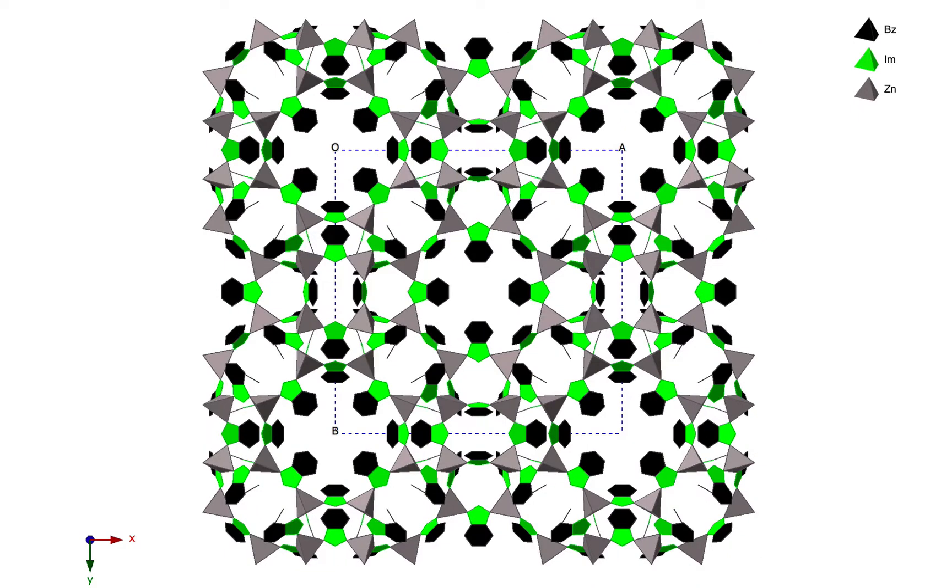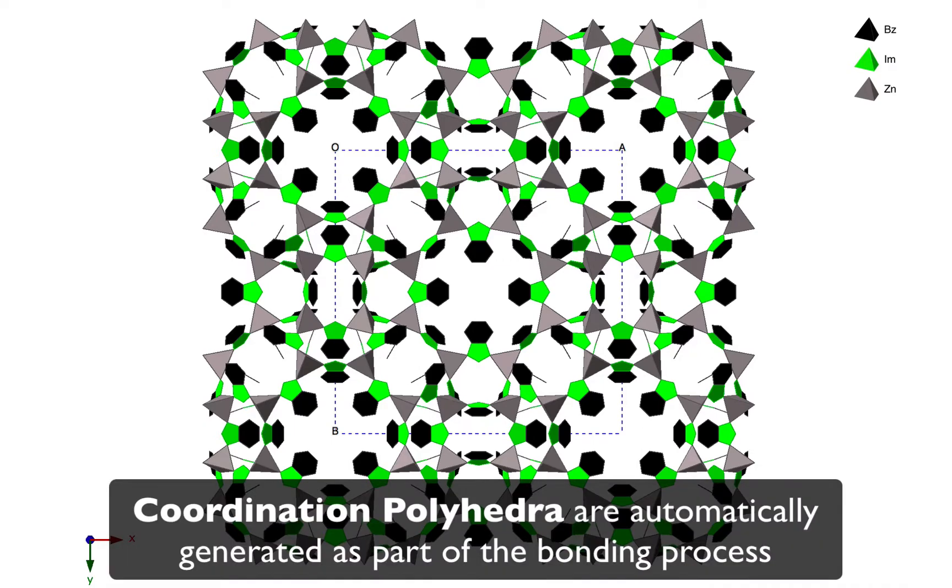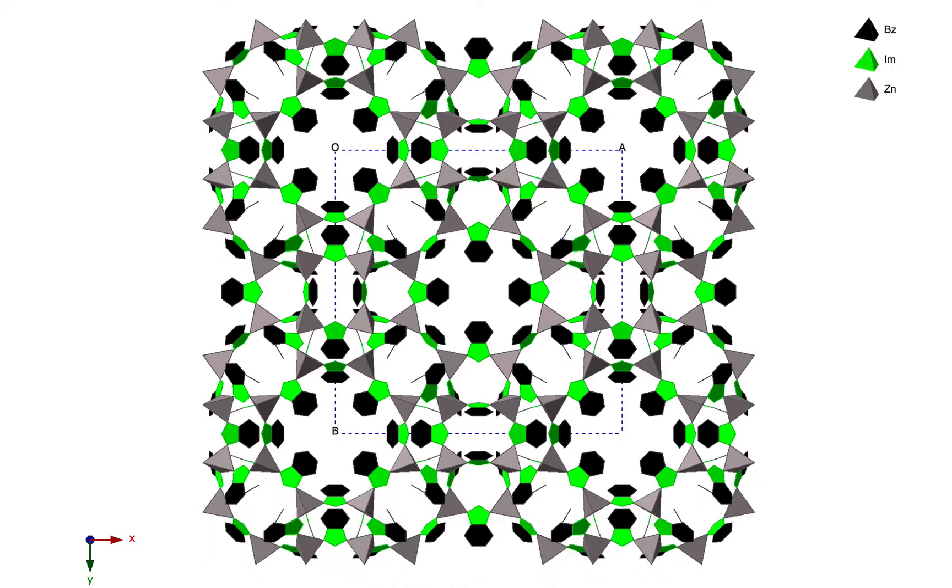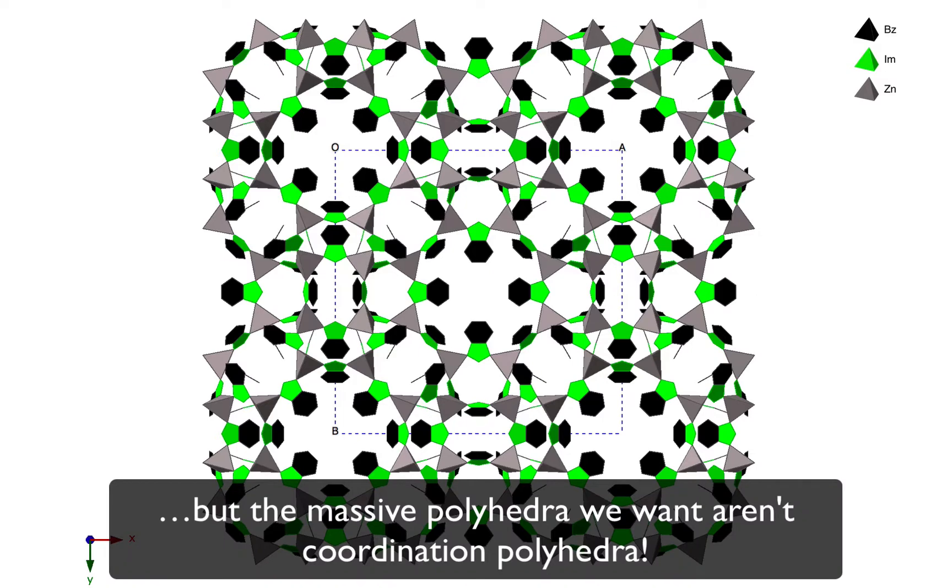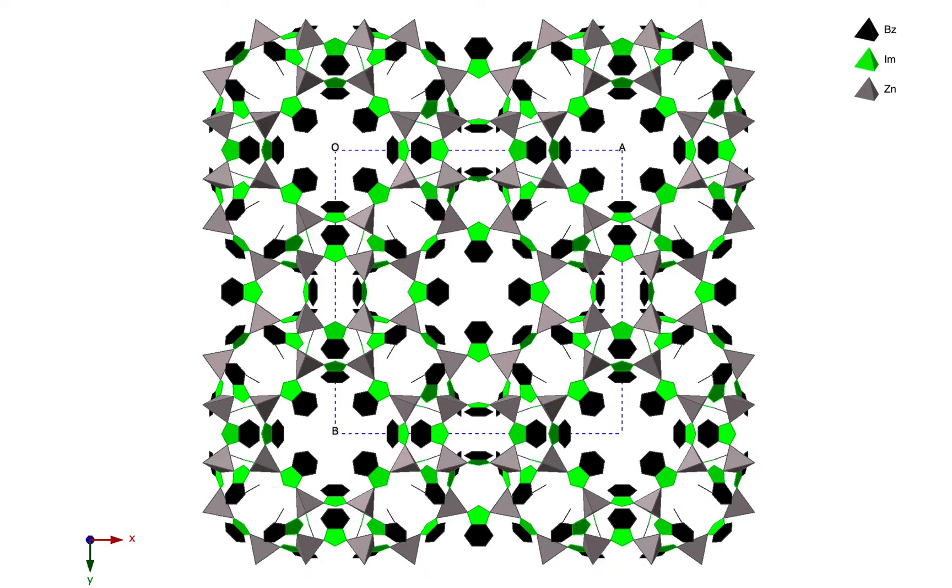We can use our built-in polyhedral model, and CrystalMaker generates coordination polyhedra automatically for you as part of the bonding process. You specify which atoms to plot as which types of polyhedra, but this doesn't generate the massive polyhedra automatically. It only generates polyhedra around existing sites with bonds.